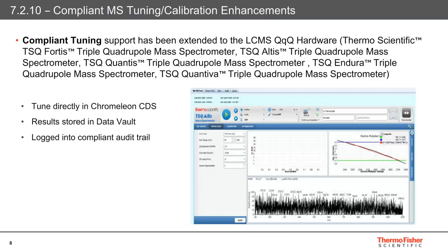Another feature that ties not only to bioanalysis but adds further security to Chromeleon CDS is compliant tuning. This feature now covers the following Thermo Scientific triple quadrupole mass spectrometers: the TSQ Fortis, TSQ Altis, TSQ Quantis, TSQ Endura, and the TSQ Quantiva. It allows the function of tuning or calibration to be accessed directly from a Chromeleon ePanel, with the results being stored securely in a Chromeleon Data Vault. The actions are also logged into a compliant audit trail, and when this feature is activated, it is not possible to access a tune application outside of the Chromeleon software.